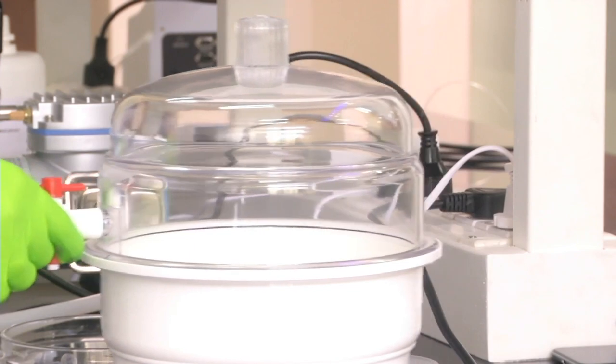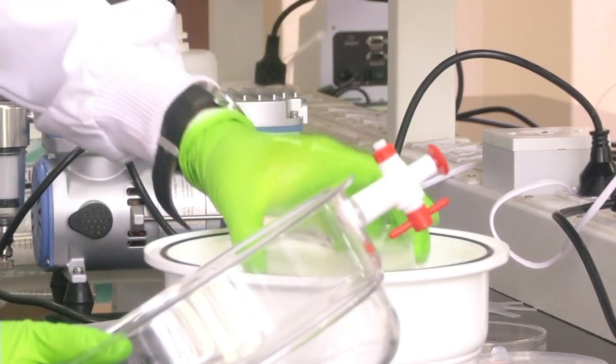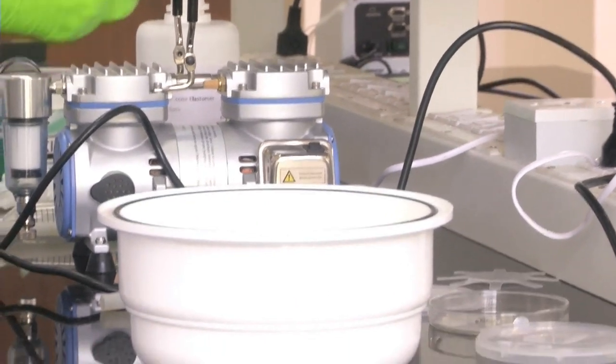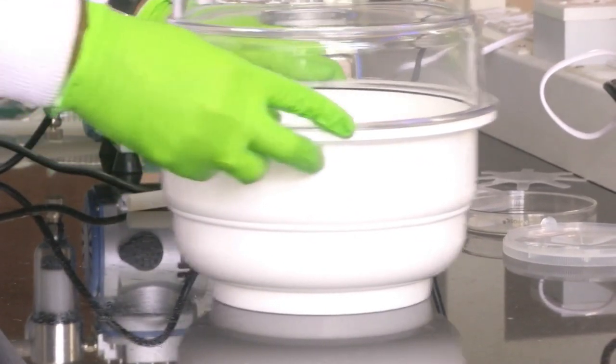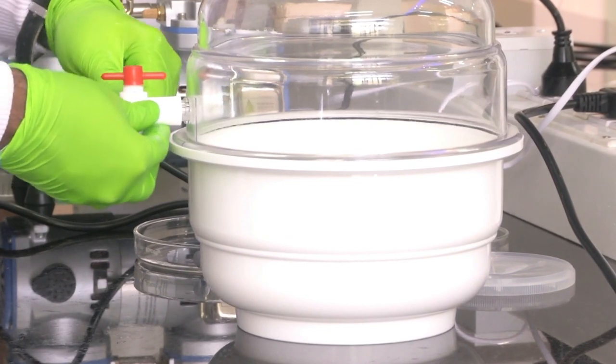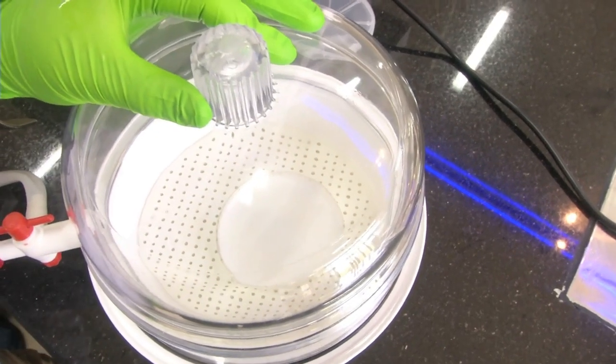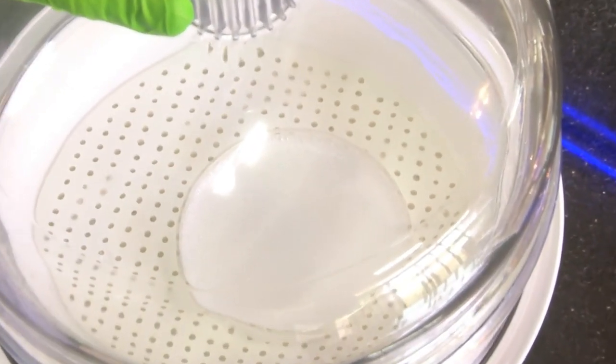What we will do now is keep this dish inside the desiccator. I am opening the lid of the desiccator. Now we have kept the dish inside the desiccator and are closing the lid. Now we will connect our vacuum pump to the inlet of the desiccator and switch on the vacuum pump. You can see that air bubbles are accumulating and coming out. As and when all the air bubbles come out, it will become a clear solution. It will take around 25 to 30 minutes to remove all the air bubbles from the mixture.